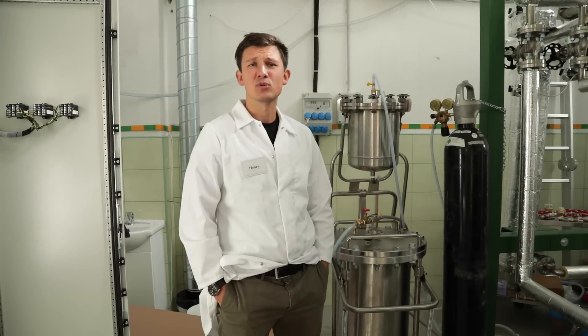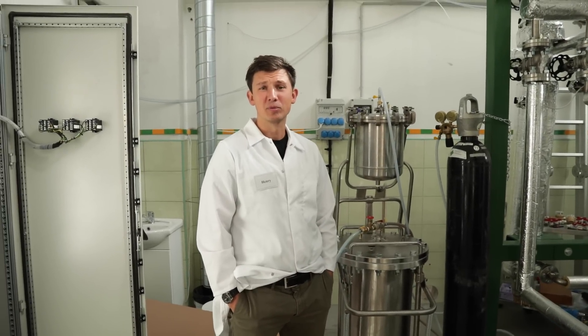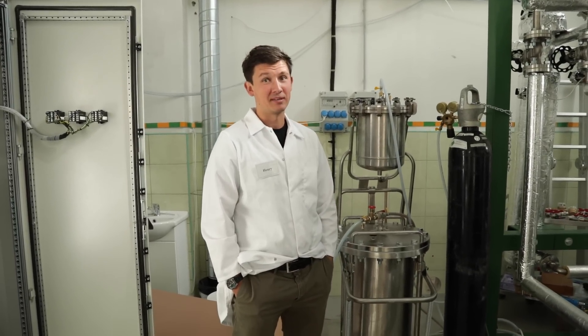Next time I'm going to show you how we do it on a big scale in real production, and that's big — even bigger than this one. Because to make kilos we need volume. If we just have to make a few grams, maybe this machine will work. But we need kilos, so we need a bigger factory for that.